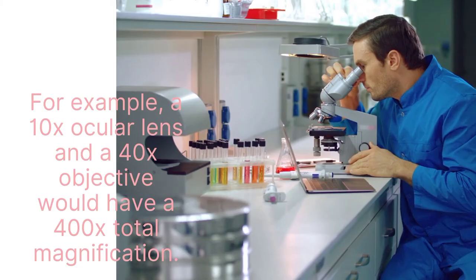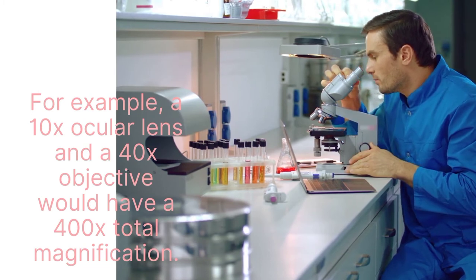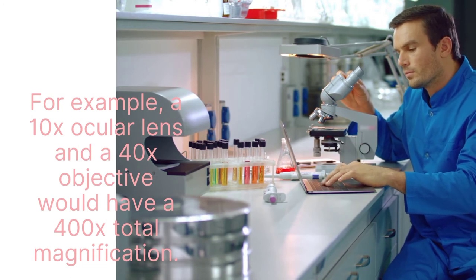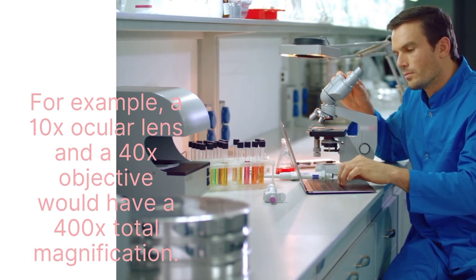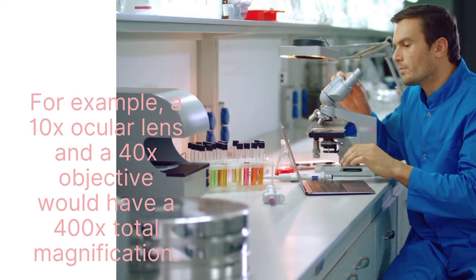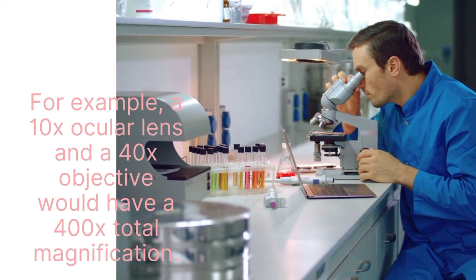To calculate the total magnification of the compound light microscope, multiply the magnification power of the ocular lens by the power of the objective lens. For example, 10x ocular lens and a 40x objective lens results in a total magnification of 400x.